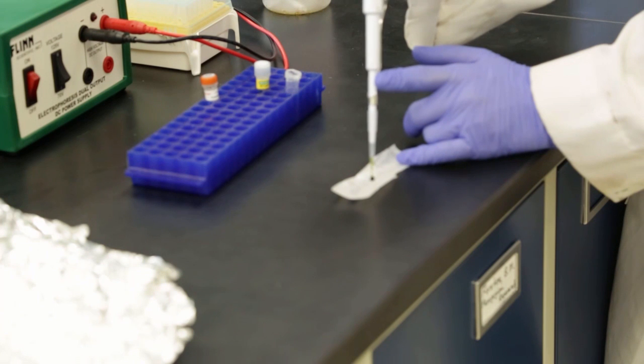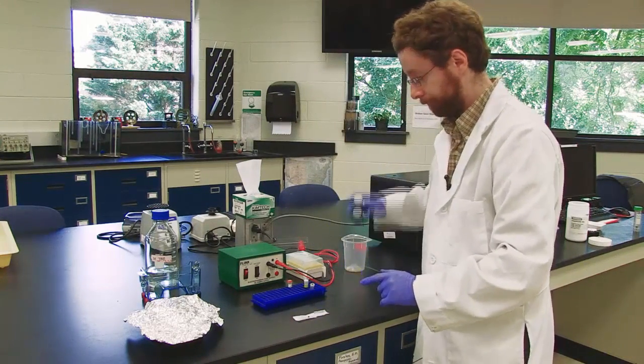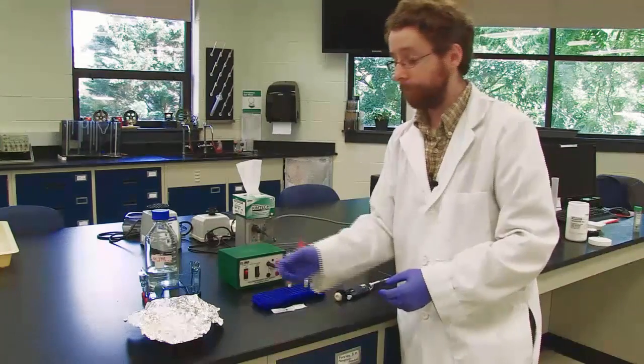And you want to mix a few times until it looks homogeneous and it's all mixed together. So our DNA sample is ready. Now we have to add it to our gel.